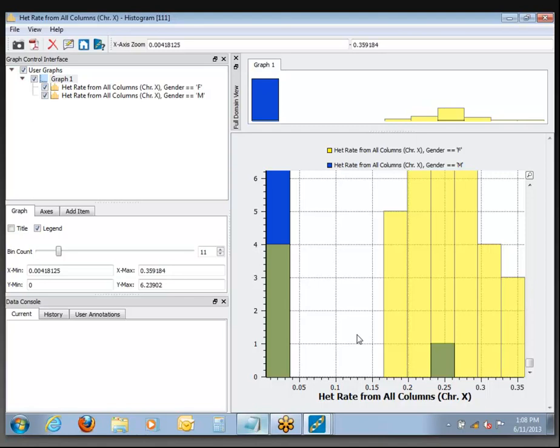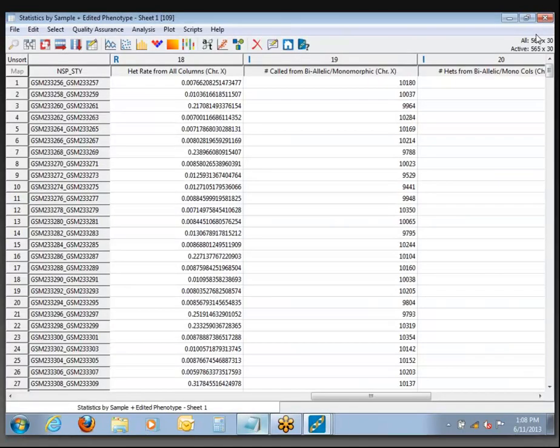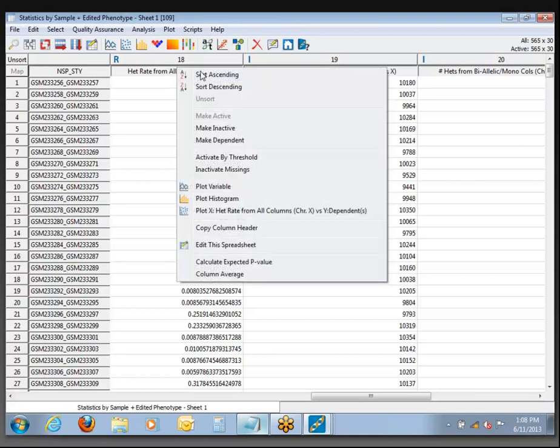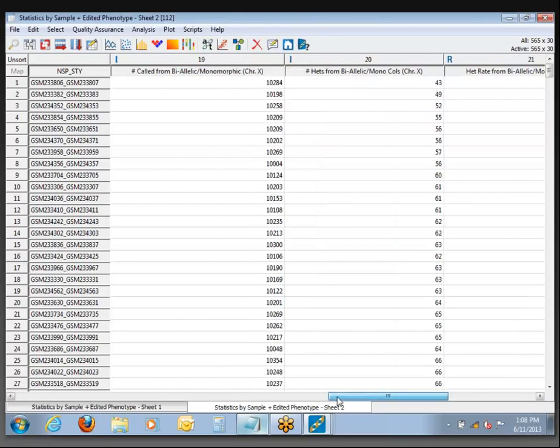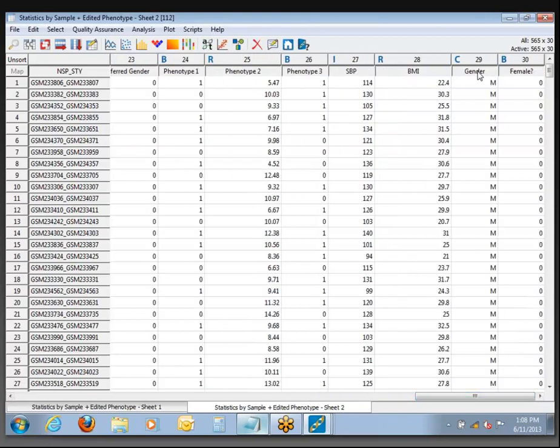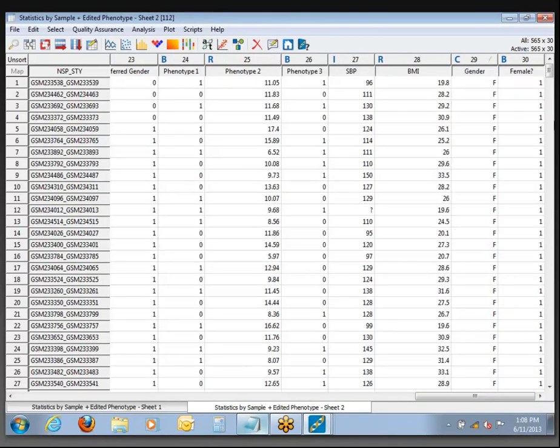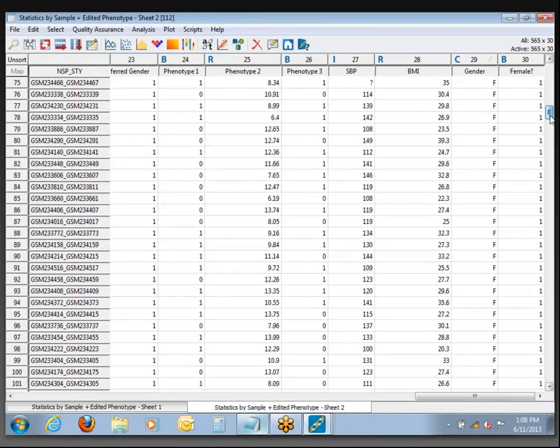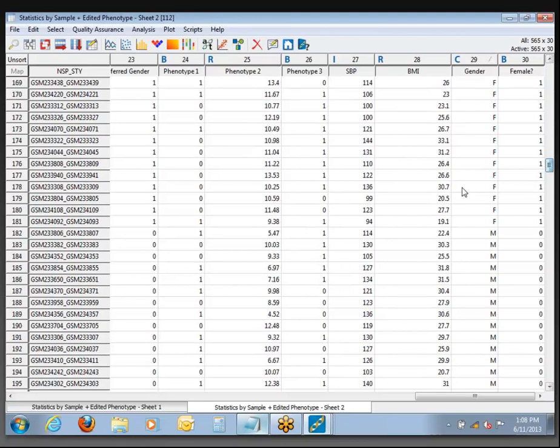If you want to find out which samples those are, come back to this spreadsheet we created, and at column 18 with that heterozygosity rate, just sort on it, then come over to the reported gender and sort again. You can usually figure it out by sorting and coming right down to the break point and comparing — you can see which samples are in the wrong place or wrong group.